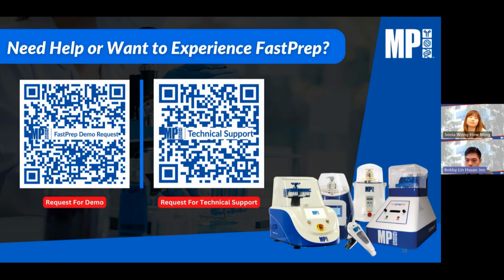So the question is, for the pig bristle samples mentioned earlier, they're used for cortisol measurement, and the customer is concerned about the damage due to long milling time when we're using a larger bead. Would switching to Lysing Matrix A or M alone be enough to resolve this issue? I think this has to do with also the time, so not just the beads itself. If we are prolonging the time, then whatever beads you're using doesn't really affect. So I think this boils down to the processing time as well. Dr. Sonia, any comments on this one?